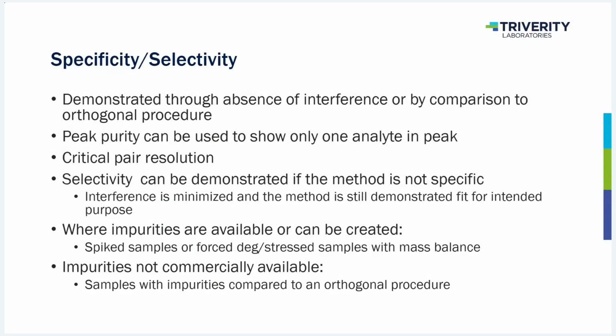We're going to walk through now all of those different performance characteristics, and then we're going to go into different methods, and I'm going to give you examples of the different types of methods that we validate and how we would validate them.